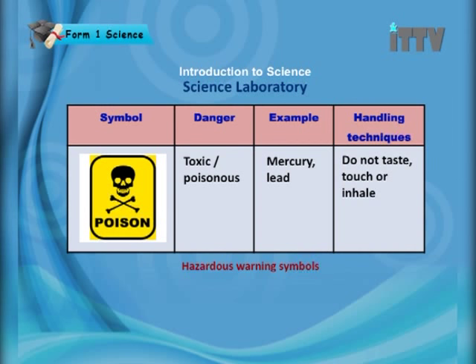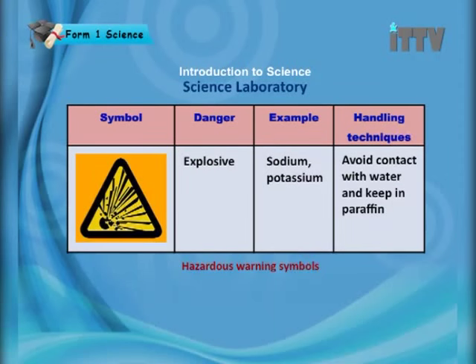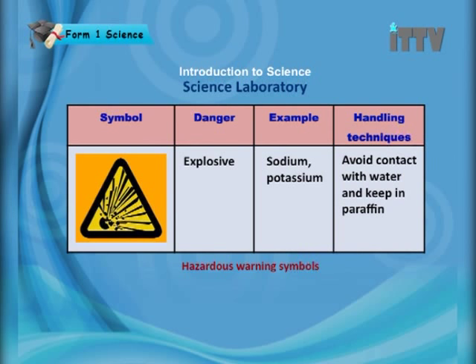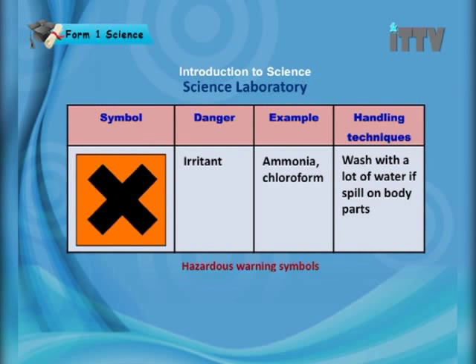Inhaling or touching toxic substances can also spread the poison. The explosion symbol warns of chemicals that can explode — examples include sodium and potassium. Avoid contact with water and keep them in paraffin oil. The irritant symbol warns of substances such as ammonia and chloroform. If you touch or spill them on body parts, wash with a lot of water.